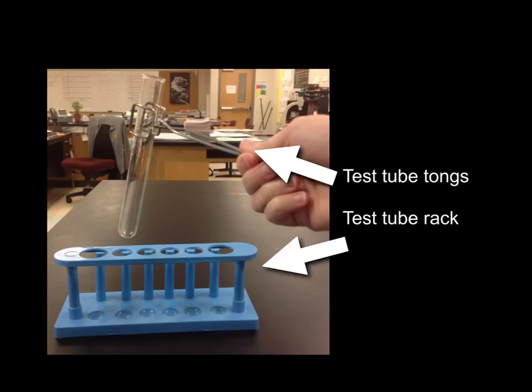When we use test tubes, there are two pieces of lab equipment that you need to know. One are the test tube tongs. That's what you would hold in your hand that will grasp a test tube. You can use it if you needed to heat up the test tube, or if you didn't want to touch the test tube for some reason, you could use the tongs. You'll also need a test tube rack to put your test tube in so that it stands up, or if you have multiple test tubes you need to manage, you can put them all in a test tube rack.